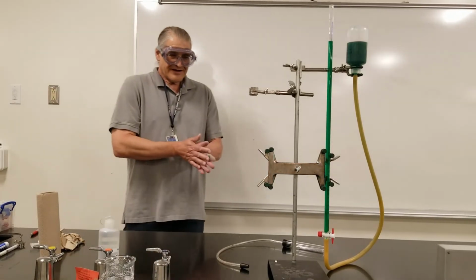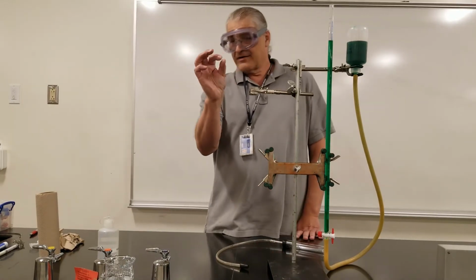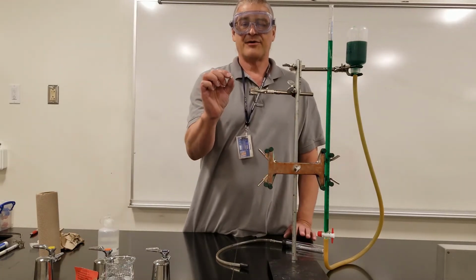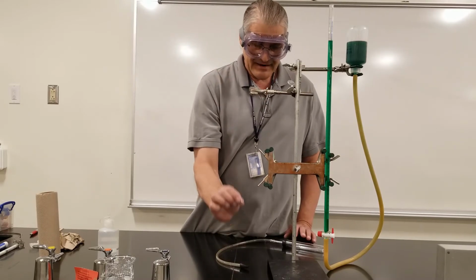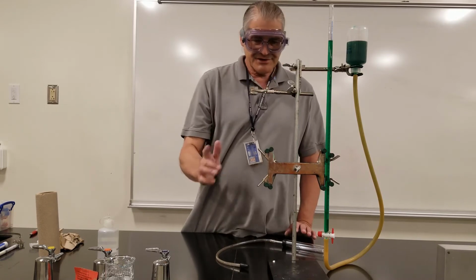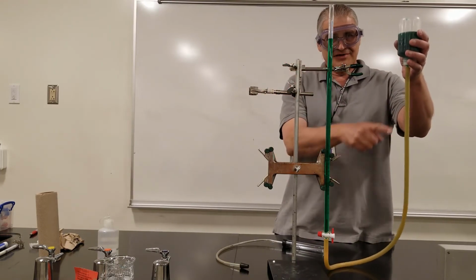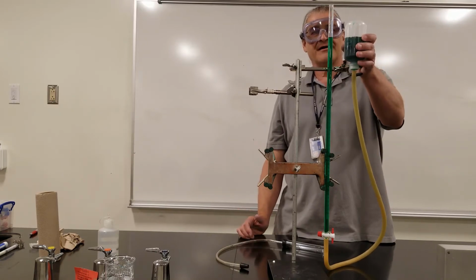Okay, how are we going to measure that carbon dioxide that's coming from our Alka Seltzer tablet? Oh, we're not going to use the whole tablet. We're just going to break off a small piece. So we will weigh this Alka Seltzer tablet, then we'll decompose it to give the CO2 gas. How do we measure that CO2 gas? With this apparatus. A simple U-shaped tube with a liquid in it. It's water. We put a little green food coloring in there.